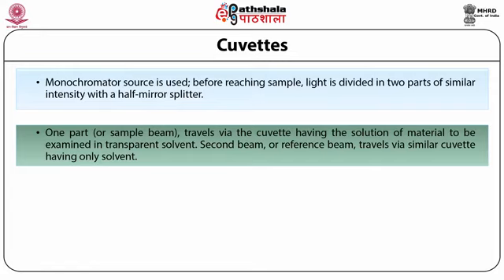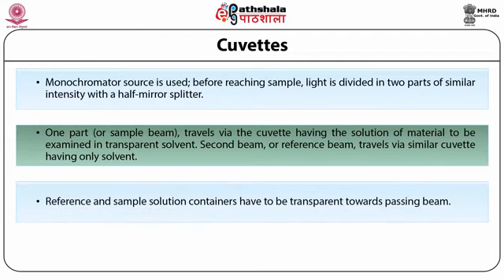The second beam, or reference beam, travels via a similar cuvette having only the solvent. So reference and sample solution containers have to be transparent towards the passing beam.